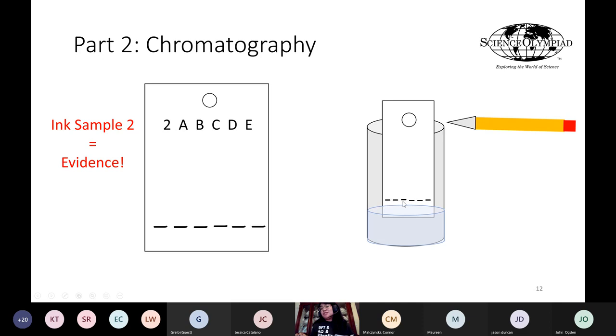Even if all the ink samples are black, let's say, as the alcohol travels up through the filter paper, they're going to see that the black ink actually splits into, like, purple that can occur closer to where the ink sample was set. And then they might see some greens or blues that make up that black color, since black is actually a combination of many different colors. Alcohol provides students with the ability to see what different ink colors make up that black ink.